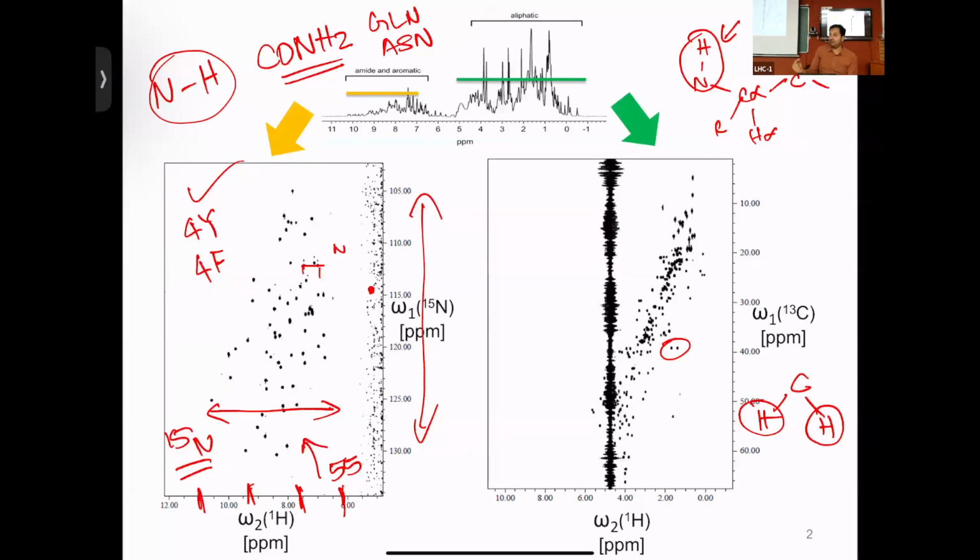Once again, highlighting the fact that chemical shifts are super cool indicators of what they are next to. Of course, you've got to solve the structure to understand all this, but the moment you see an anomaly, it's very interesting to see what's going on, right? Yes.